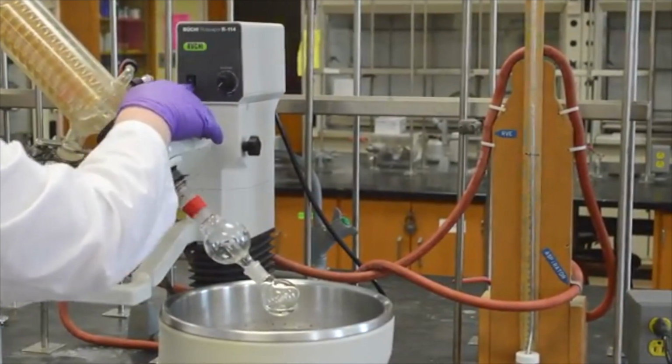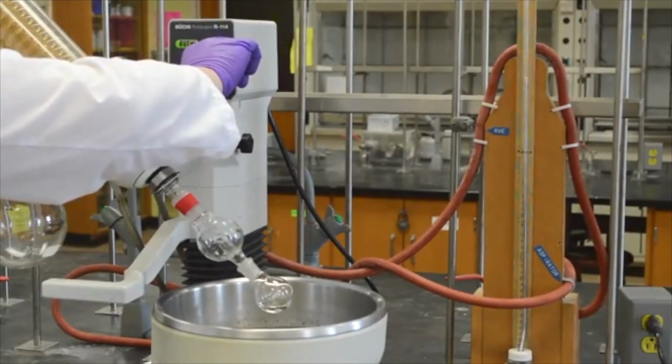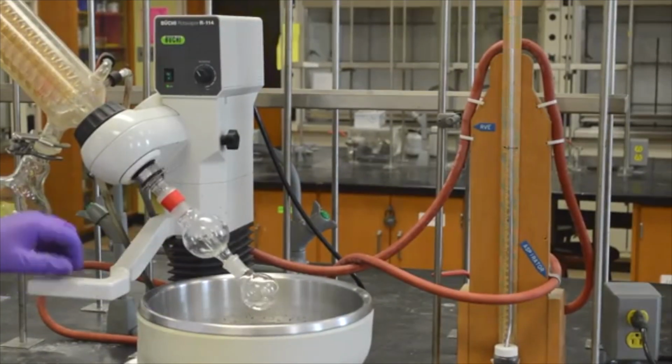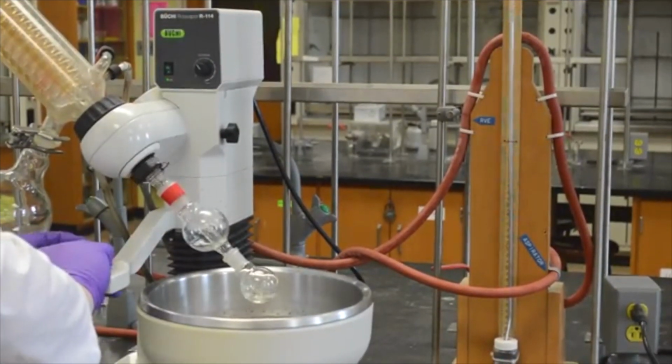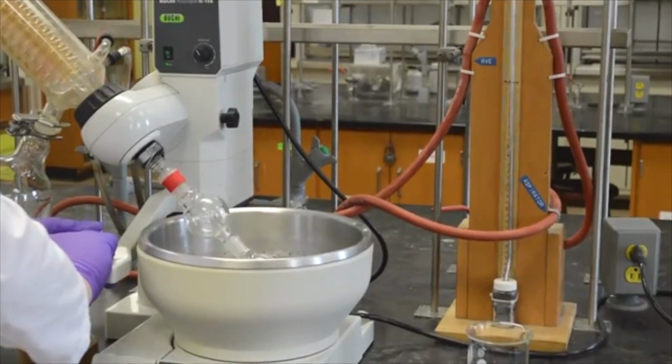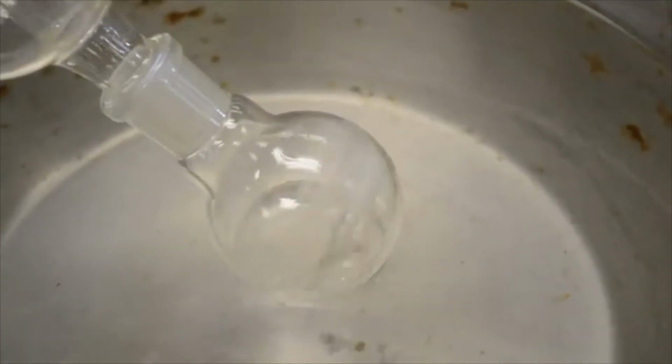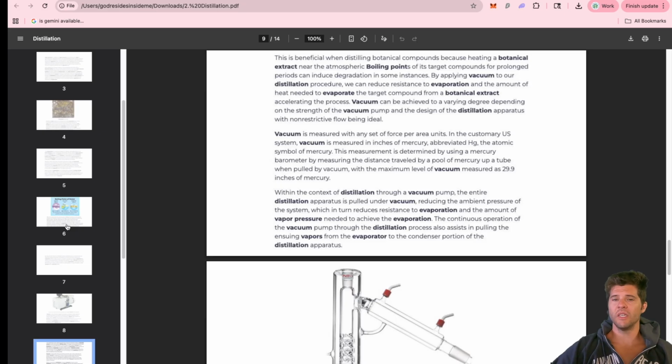Also, in your rotary evaporator, it's the exact same concept. Using a vacuum pump to decrease the atmospheric pressure also helps you sort through a lot more solvent a lot faster. This would also be considered distillation. You would distill the solvent in your rotary evaporator, and then you would recondense the solvent over a condensing column, returning it from its gaseous state to its liquid state, where you could then collect the purified solvent for reuse later. And so obviously bringing things under a deep vacuum, decreasing the atmospheric pressure that it has to overcome to reach its boiling point, helps with maximum efficiency.